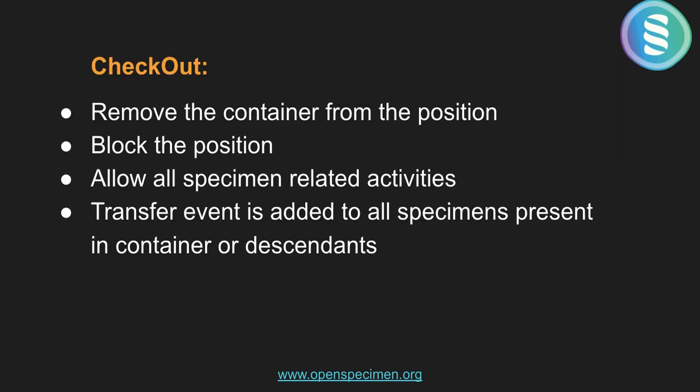So for checkout, it will remove the container from the position. It will still block the position of the original container. It will allow all specimen related activities to be performed within the container. A transfer event is added to all specimens present inside the container or any of the descendants of the container.